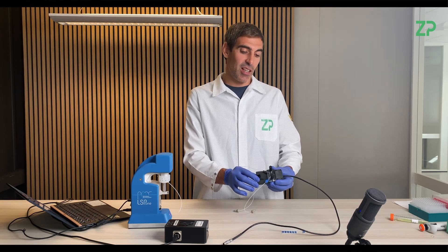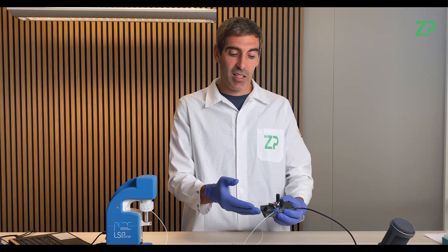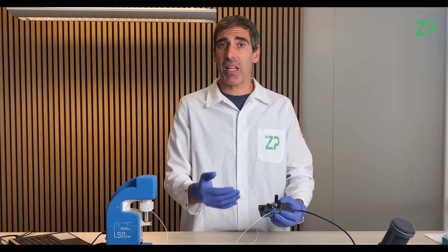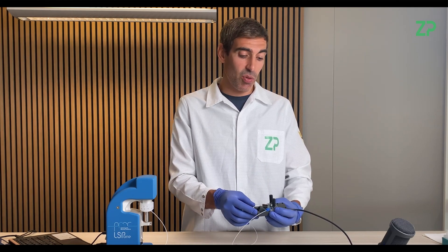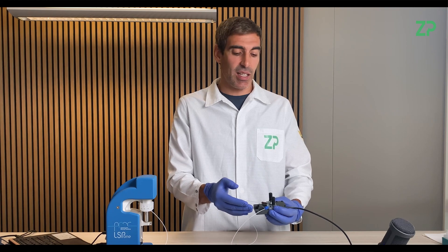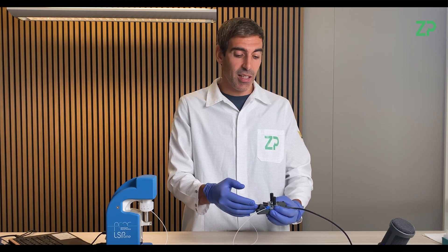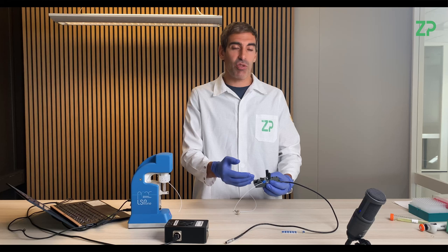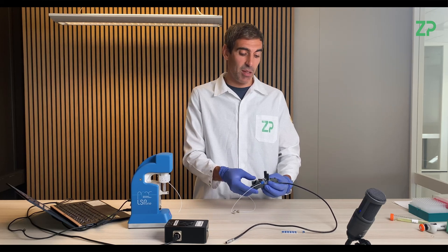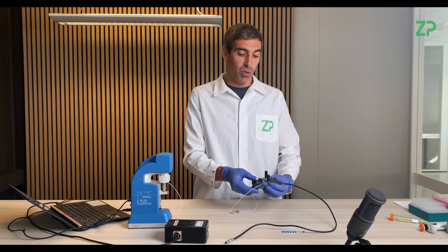As you can see, you have a microfluidic system so you can pipette very small volumes into it. It also allows you to control the volume inside and to do continuous monitoring without actually removing the sensor from the medium. So it's a very powerful tool.